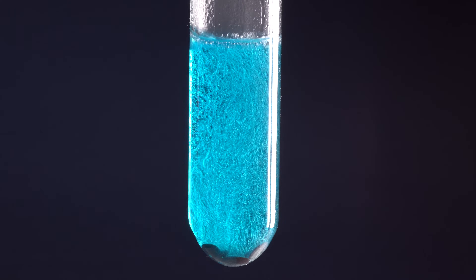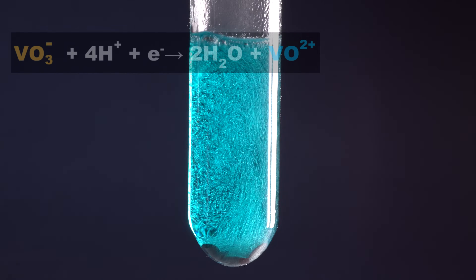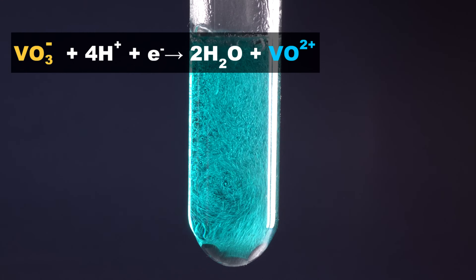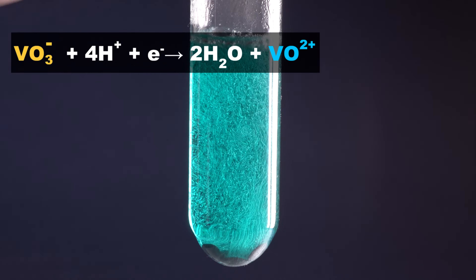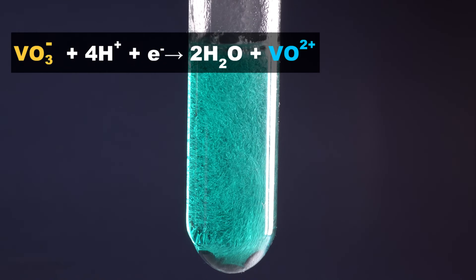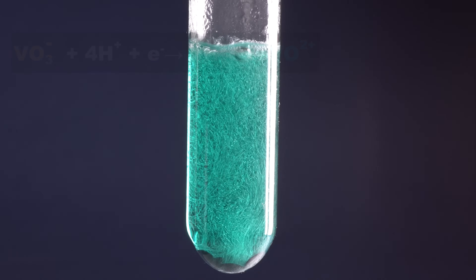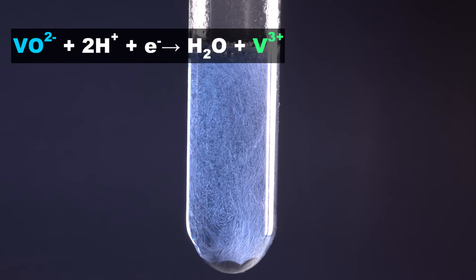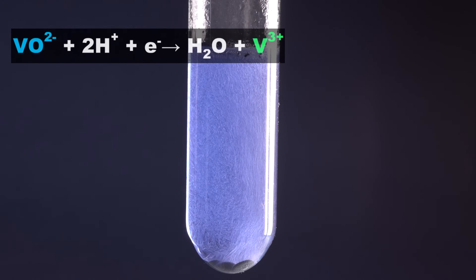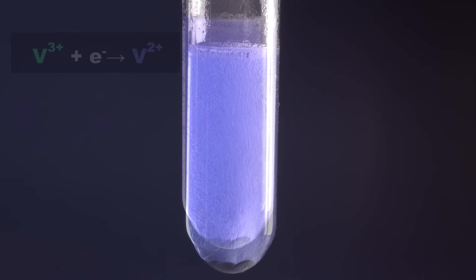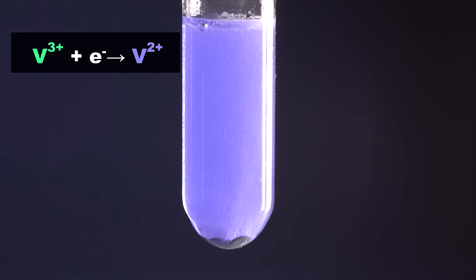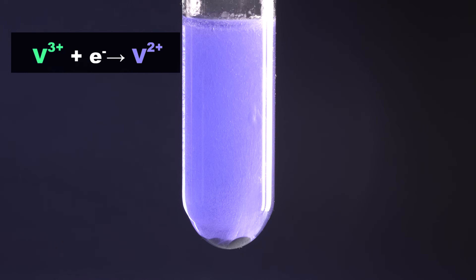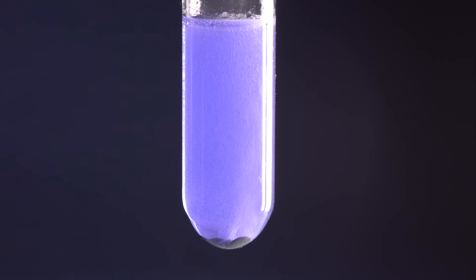Over time, the color of the solution changed to blue, due to hydrogen restoring vanadium to oxidation state +4. Further, the solution gradually acquires a green color, due to the addition of one more electron by the vanadium atom. At the end, after some time, the solution becomes violet, since vanadium has taken all the electrons from the atomic hydrogen, while restoring itself to bivalent vanadium.